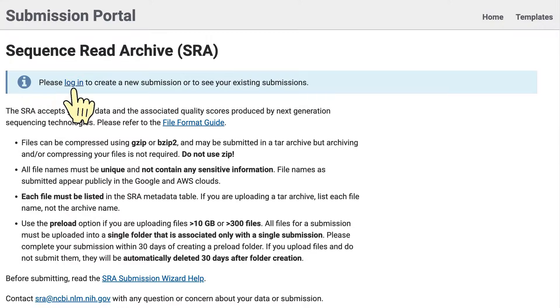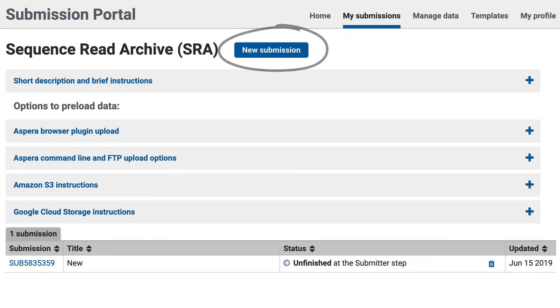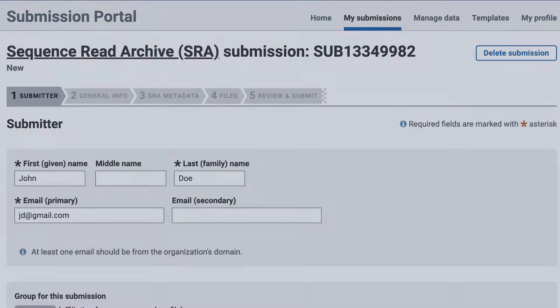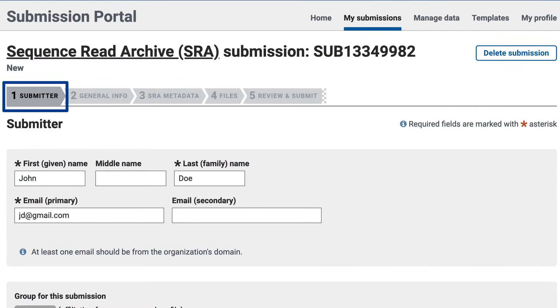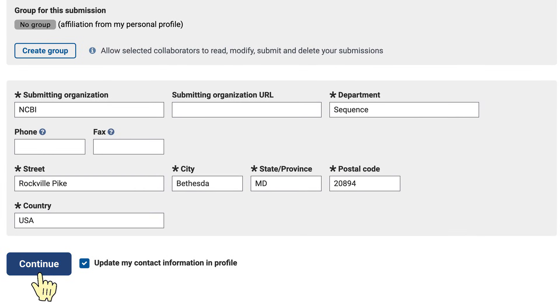After logging in, click on New Submission. In this example, I'm submitting paired-end sequences from a mouse metagenomics study. In the Submitter page, fill in or make any updates to your information, then click Continue.